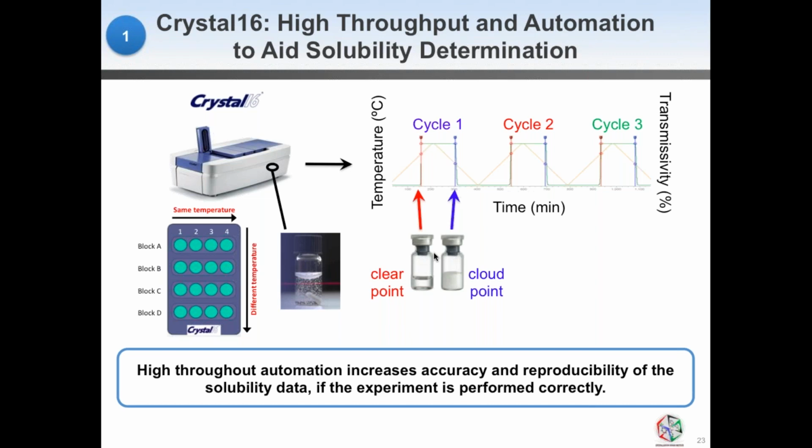And then you can imagine, if we have one large crystal, the probability that this one large crystal is obstructing the path of light is relatively low. However, if we have relatively small crystals, the number of crystals that can obstruct the light is higher. So I cannot give a general rule of thumb, but of course you are limited if you really go, in our experience, below 1 milligram per milliliter.